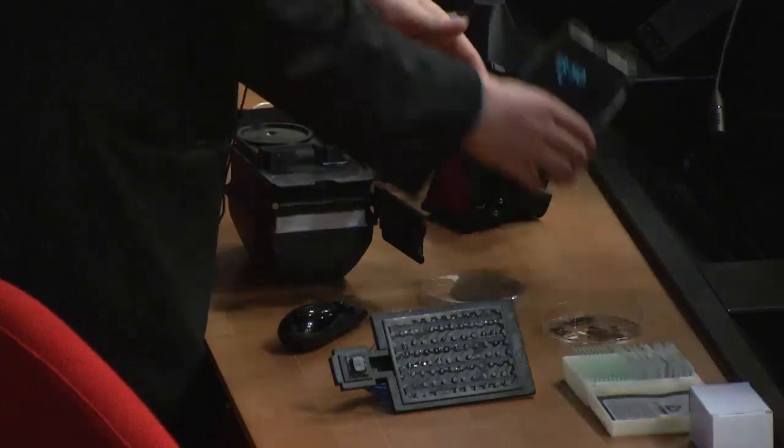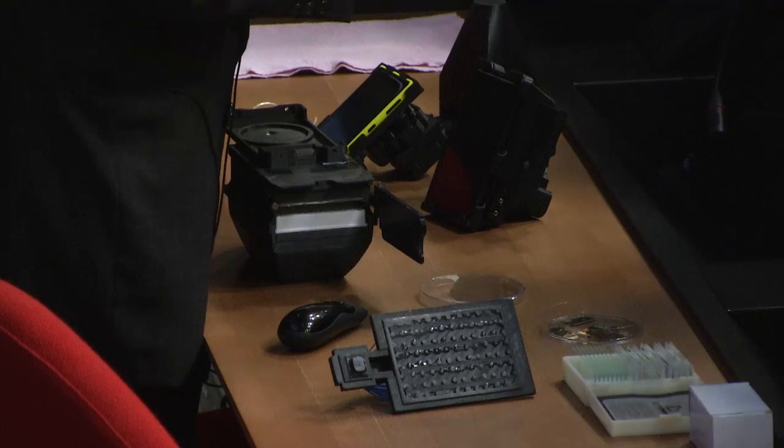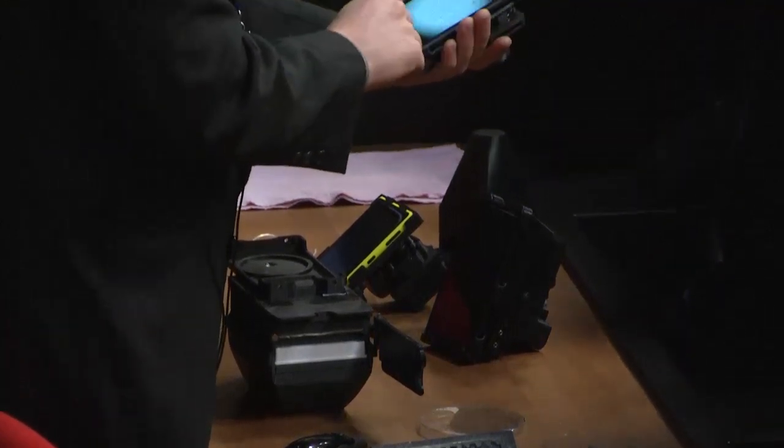Yeah, so this is here. Let me turn it on. This is the transmission-based microscope. Here's an example of the blood cells. Now let me go to the live camera.